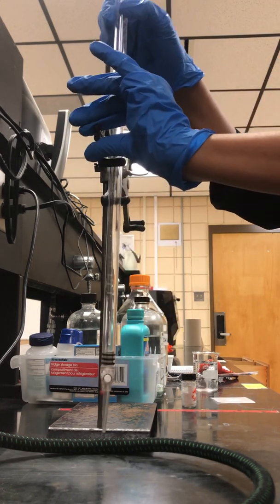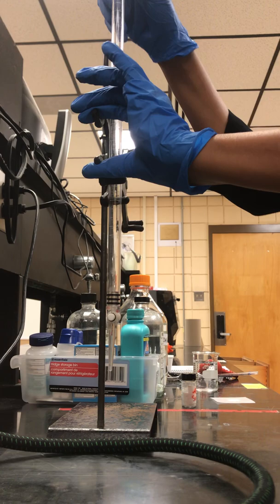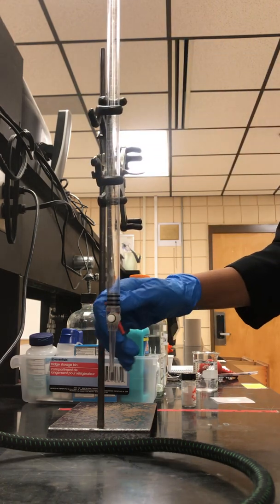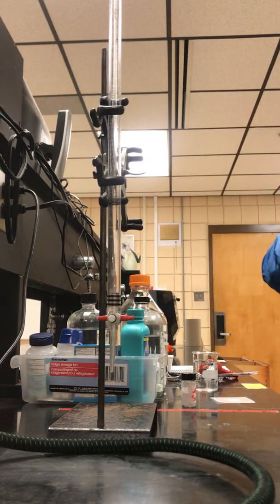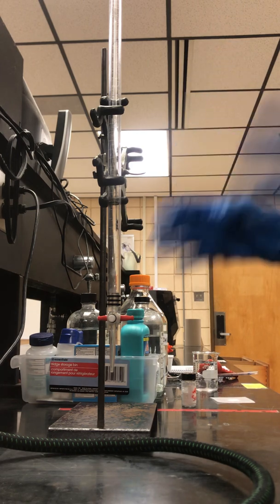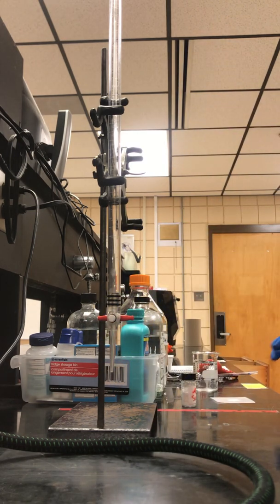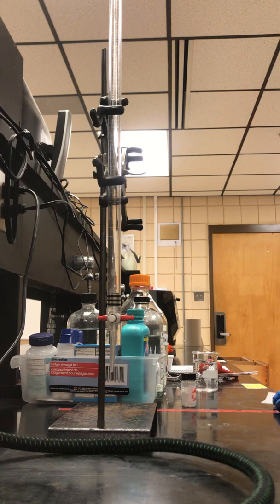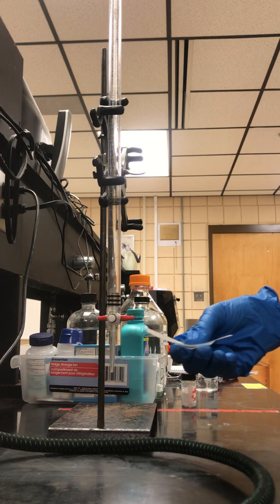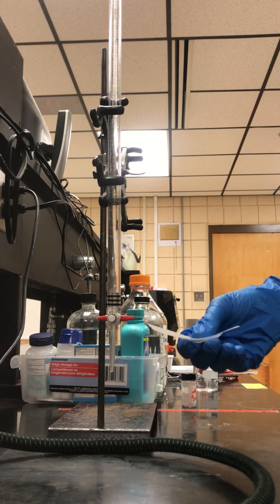You're going to obtain your burette from shelf I. You just pinch the sides and set it up. You want to close the stopcock so that once you finally set it up nothing comes out.